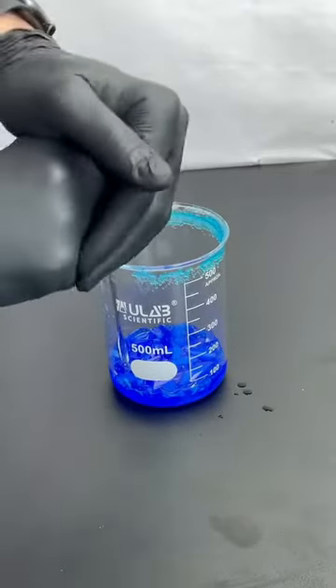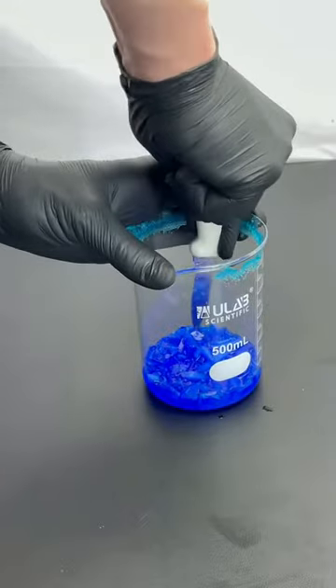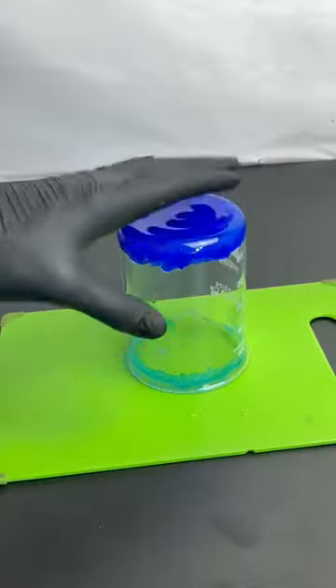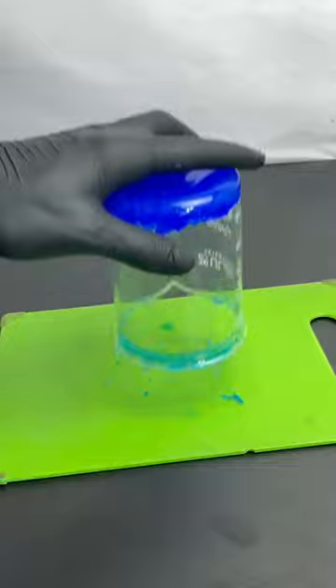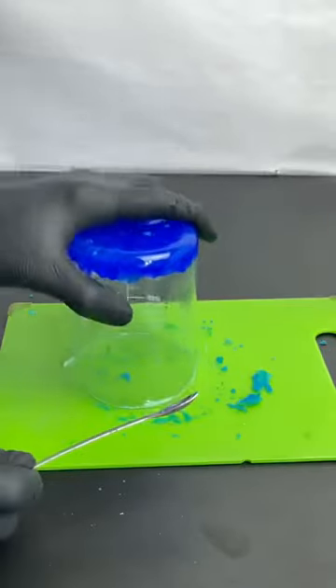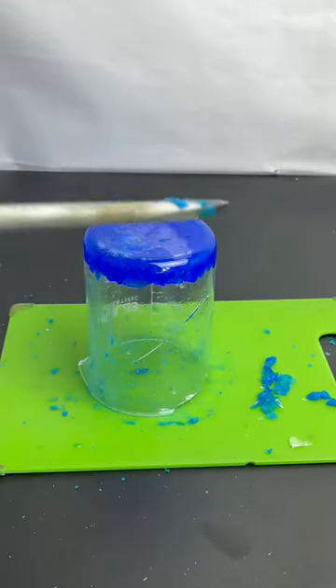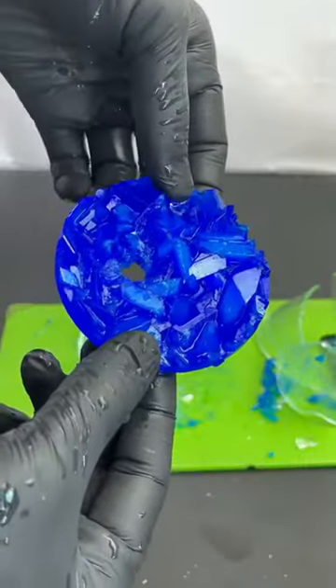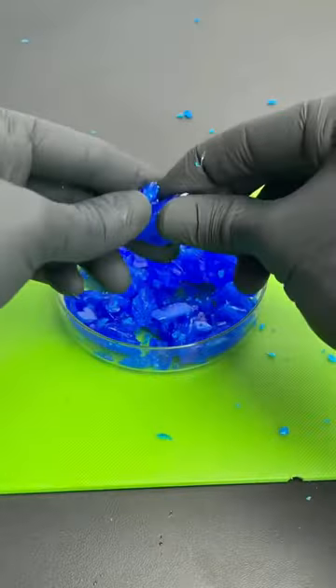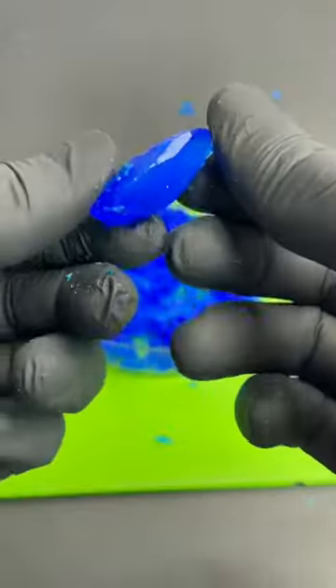I had a little trouble getting the crystals out of the beaker, though. This is the polycrystalline form of copper sulfate, and I can pull off a single crystal right here, and you can see it looks pretty cool.